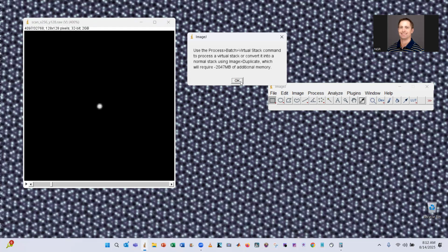So basically, unless your scan is small enough to be opened in full, the easier thing to do is probably to just flip the images vertically with whatever software you use for your reconstruction. But you have to keep in mind that you need to do that when you actually do your reconstruction, right? You've got to flip your DPs about the horizontal axis, which they call flipping vertically.